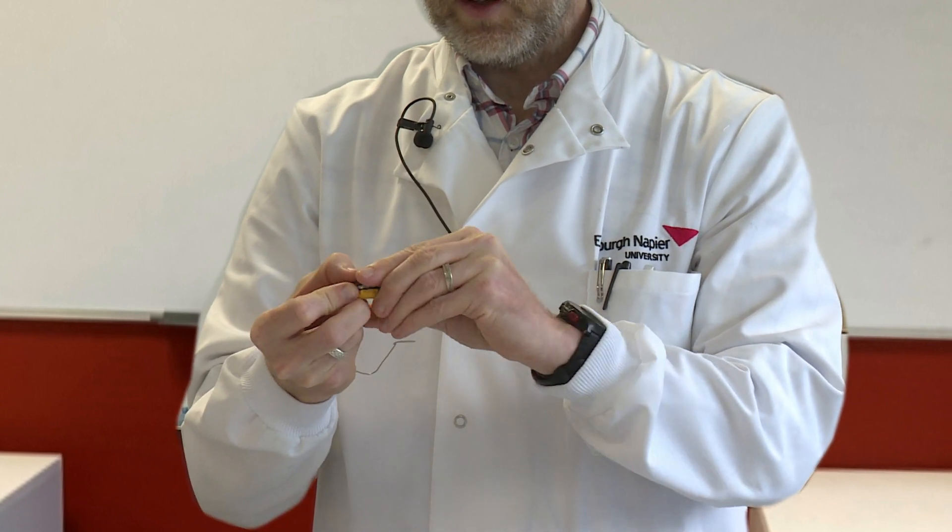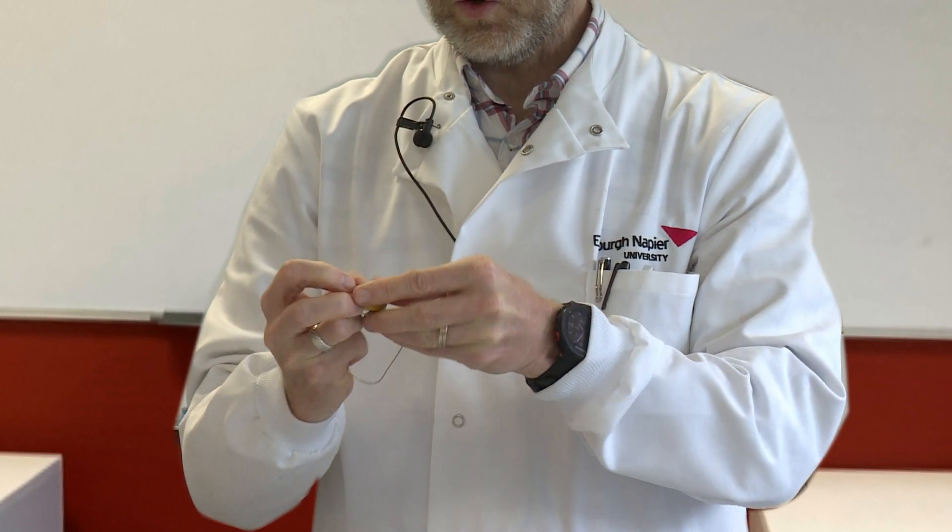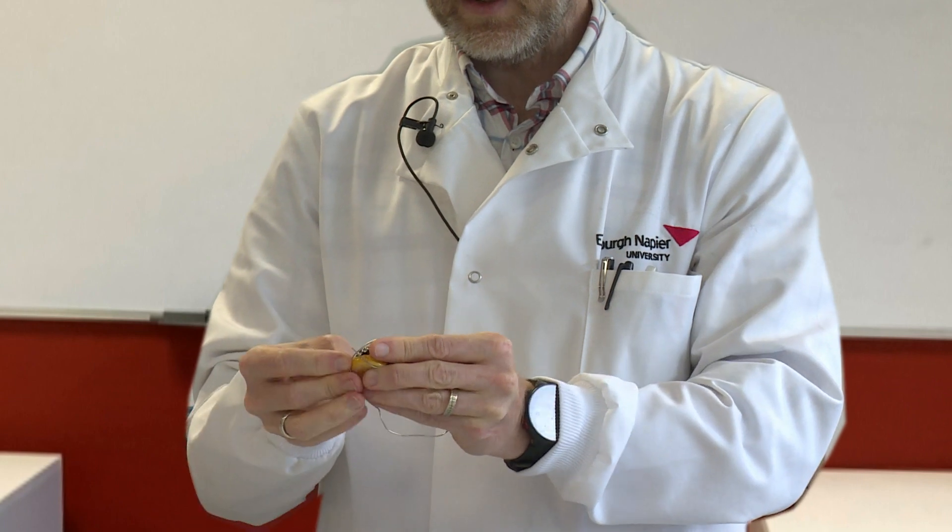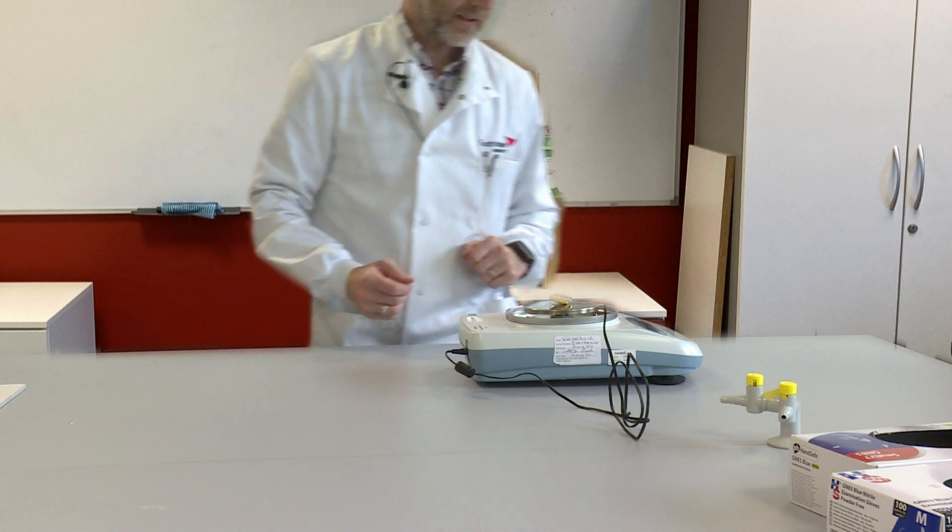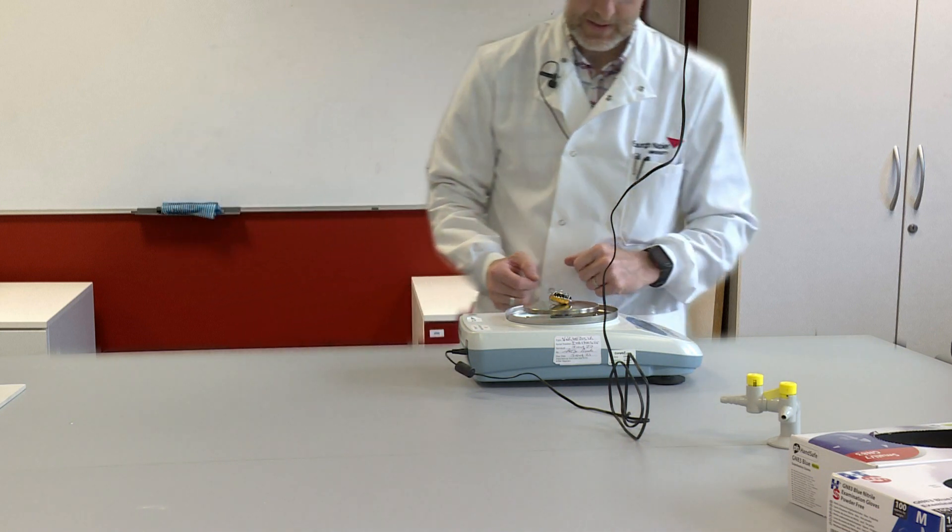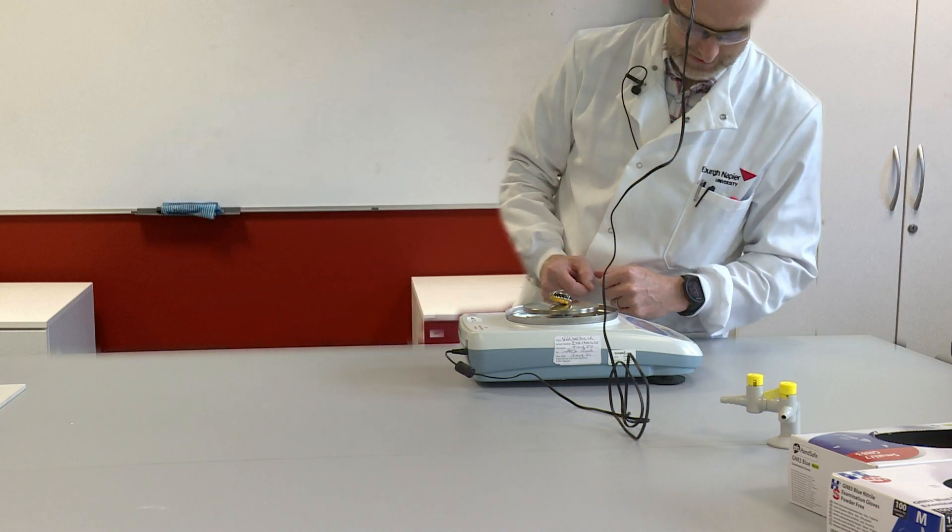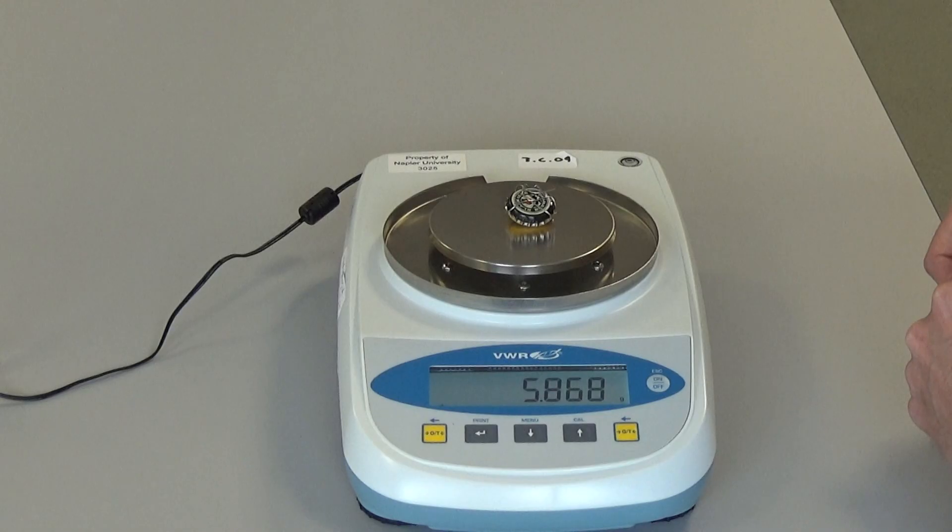That should hold the bottle tops tightly closed. So I'm going to weigh the magnesium ribbon that is now inside the two bottle tops held together by the nichrome wire, and that is 5.868 grams.